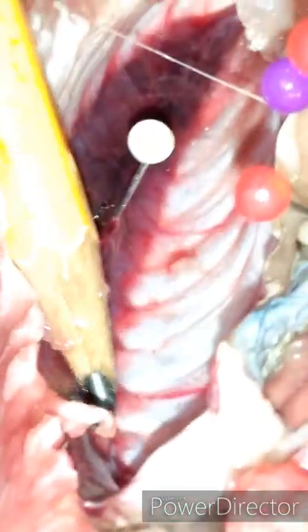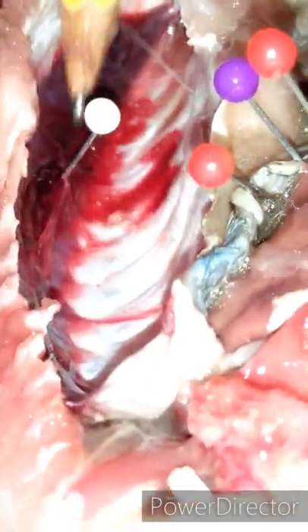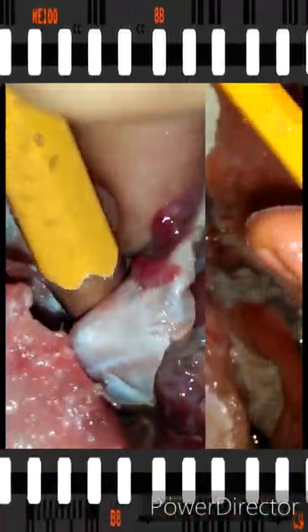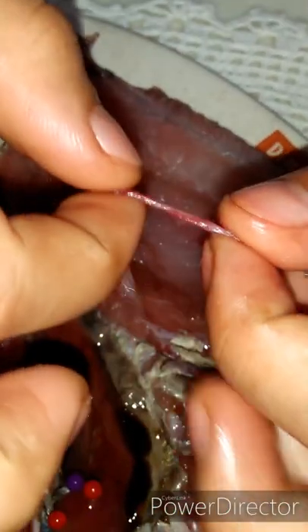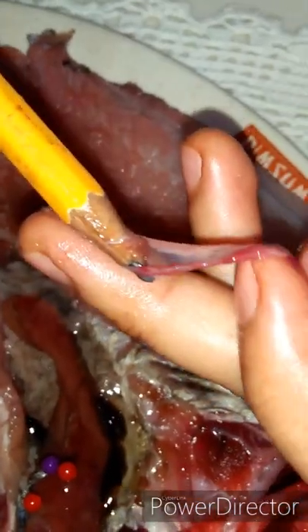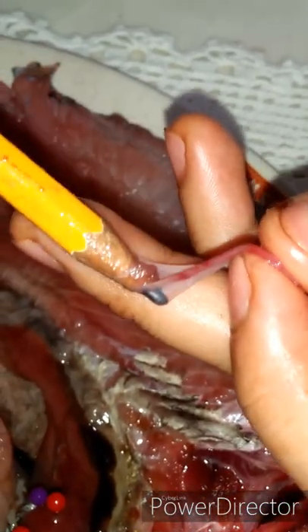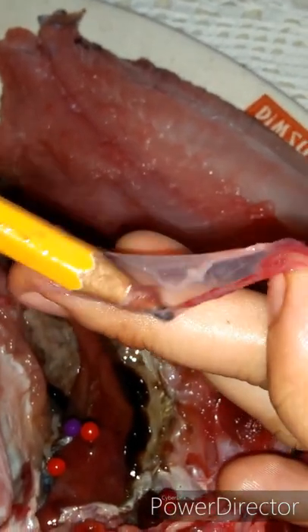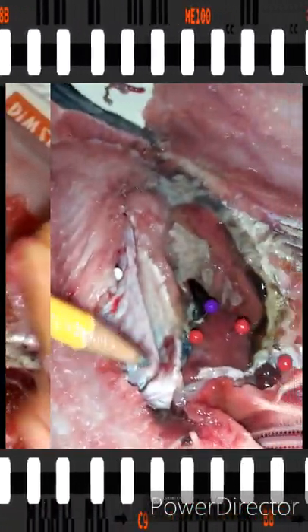This is where the swim bladder is located. I think I accidentally popped the swim bladder, so this is what it looks like now. The swim bladder normally looks like a balloon and is used to control the buoyancy of the fish. The coloration of the swim bladder is colorless.